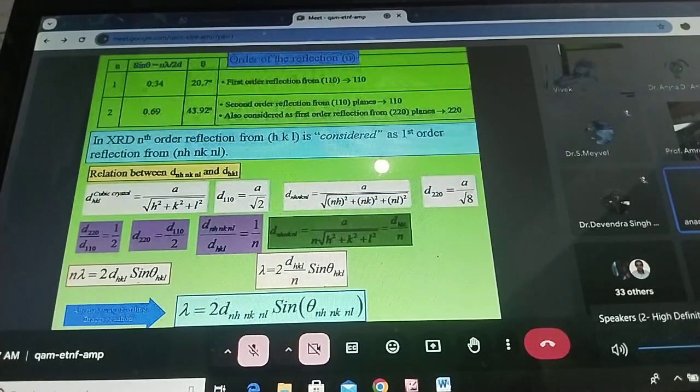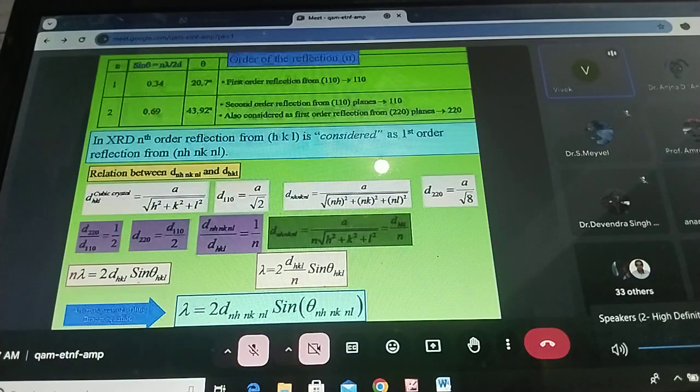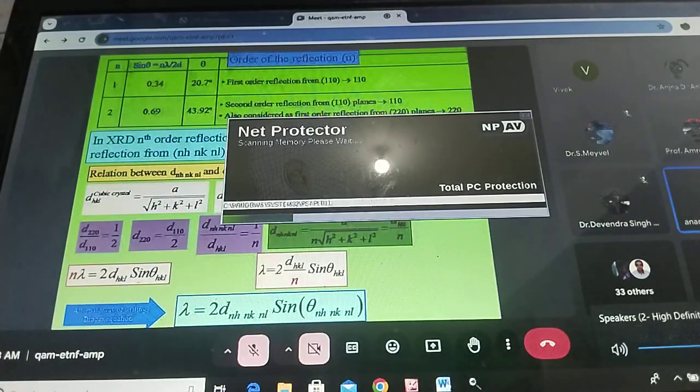Sir, as you have said, we are getting the intensity, whether it is constructive or destructive, from the setup place, right? X-rays are falling on the sample, electrons are vibrating with the same. Sir, my question is, can we have information in the X-ray diffraction pattern of monolayer graphene?